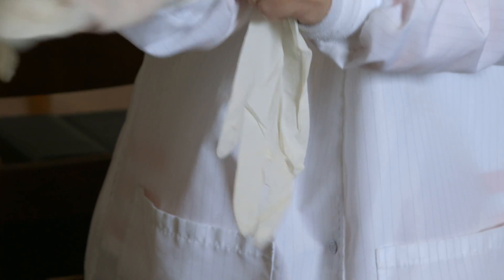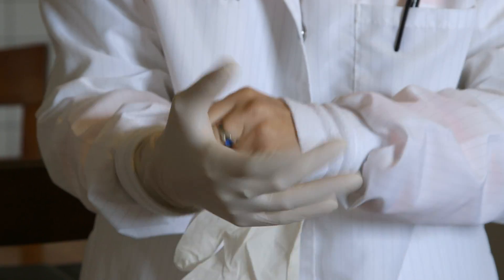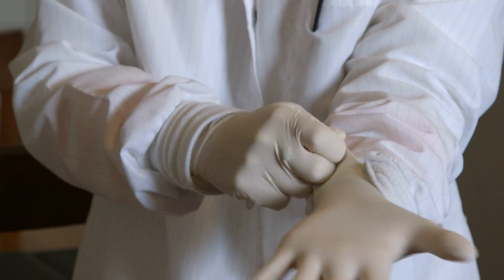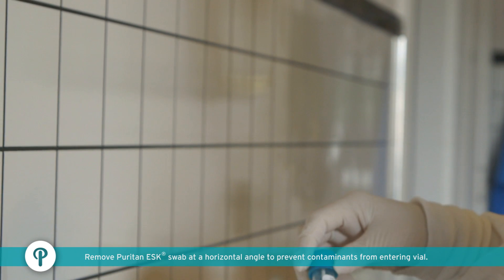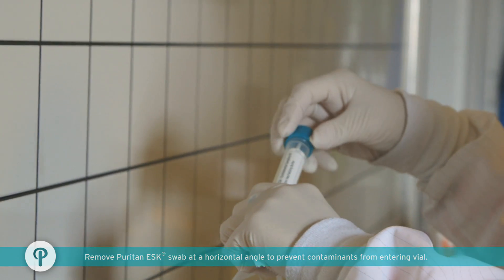Put latex gloves on hands. Open and remove the Puritan ESK from its package, and remove the Puritan ESK swab from the vial by holding the cap and twisting counter-clockwise.